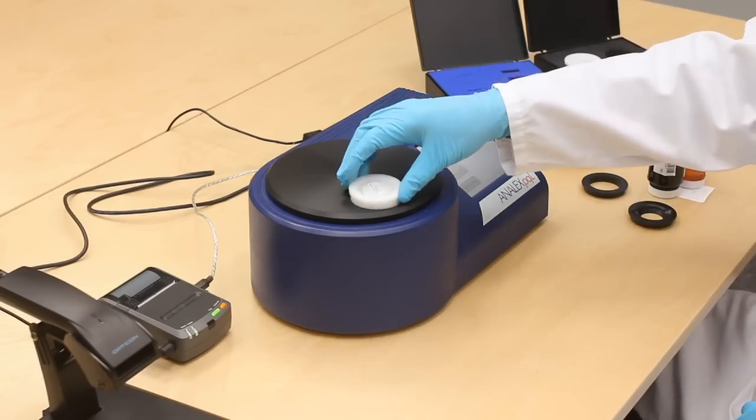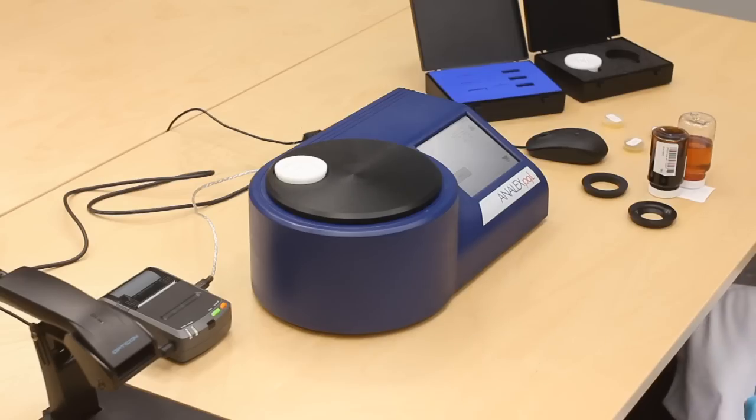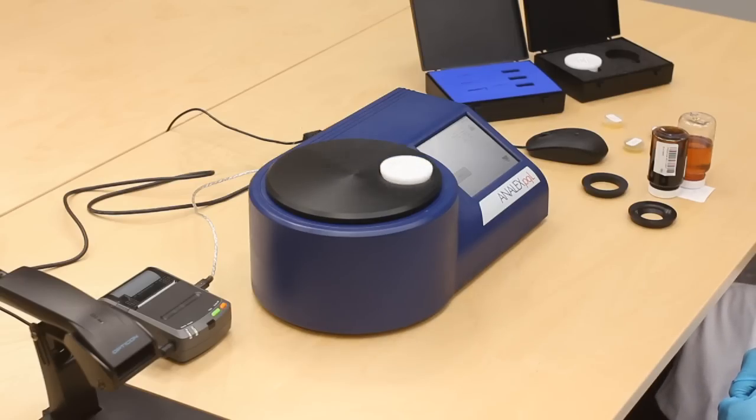Calibration reference samples are also provided with the device for in-lab verification of the equipment and measurements.